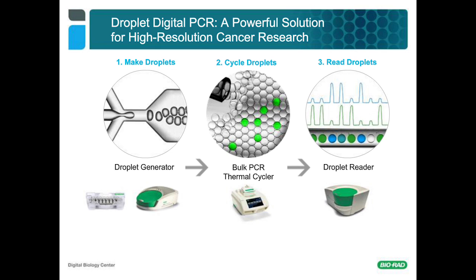We take a typical 20 microliter reaction and partition it into about 20,000 droplets. Run the plate in a standard 96-well thermocycler, then read each droplet in a flow cytometer-like fashion. Droplets containing the target become fluorescent and are counted positive by the droplet reader. Droplets without target are negative. For one reaction, we effectively go from analog to thousands of discrete yes-no answers.